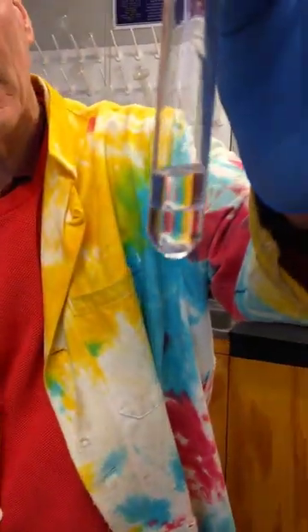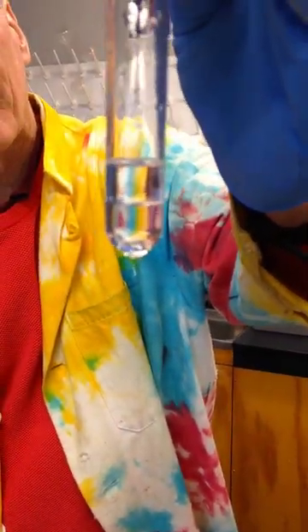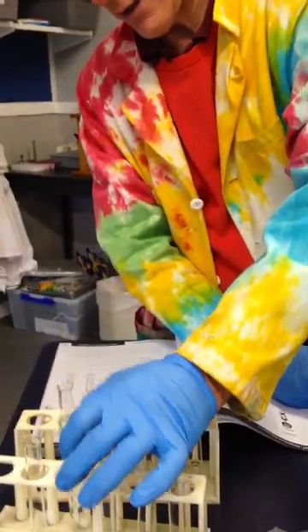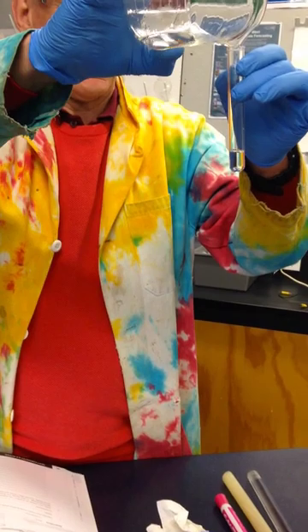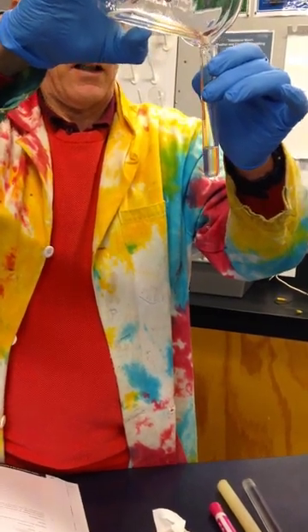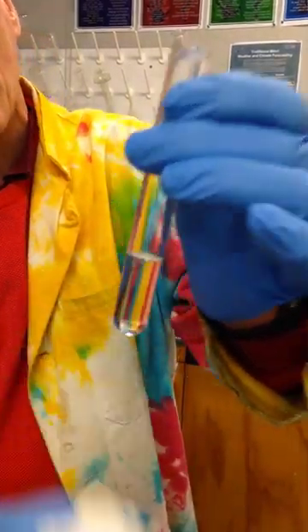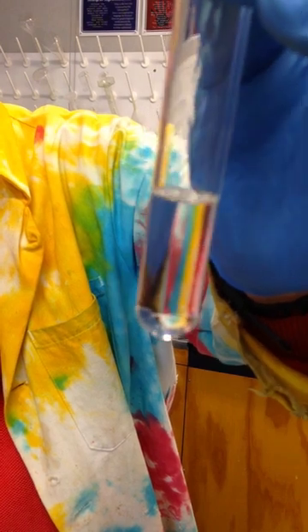Again, it separates out into two layers. So what's causing that? This is immiscible. And then the final one is turpentine and hexane. And this time they should dissolve. So the turpentine dissolves in the hexane and you get one mixture, a homogeneous mixture. And you should think about why that result happened.